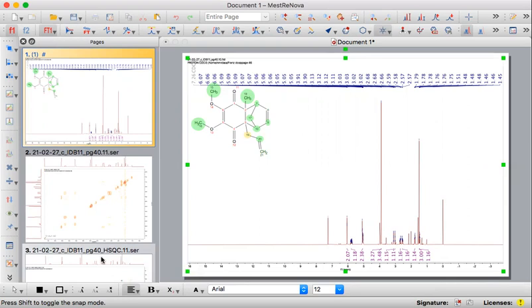But for your assignment, you're going to be using both a hydrogen and a carbon spectra to process your two-dimensional spectra as well. So the first thing that we need to do is make sure that both of those one-dimensional spectra are fully processed to get the integration, peak picking, and if you want, you can also assign all of those peaks to a structure.